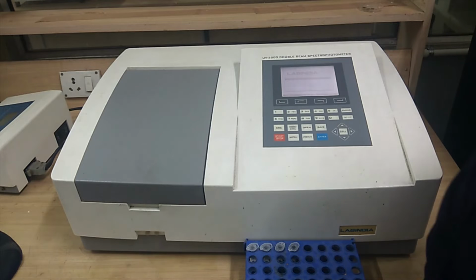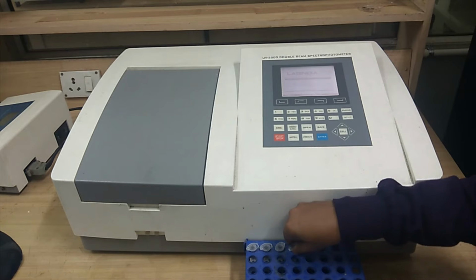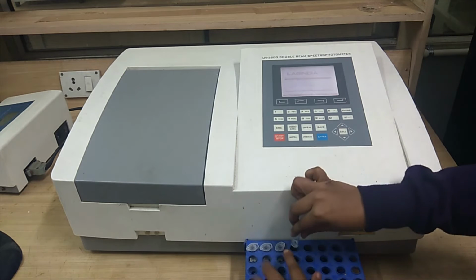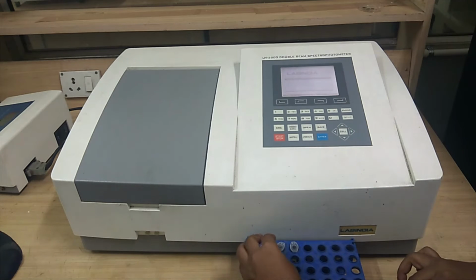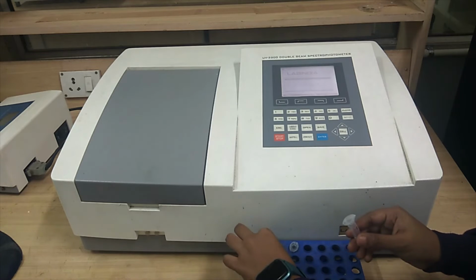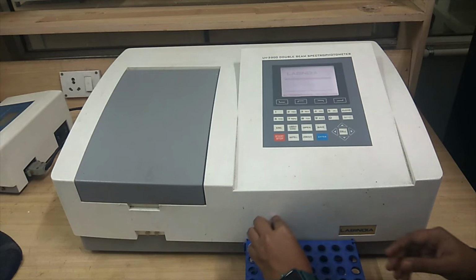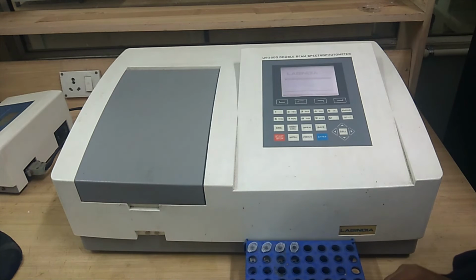For the experimental process, we have taken a stock solution of protein, and we have serially diluted it in 3 different volumes, having an increasing amount of protein, and we have made the final volume to around 500 microliter. And now we will be adding the Bradford reagent inside it, so that we can do the protein estimation further.